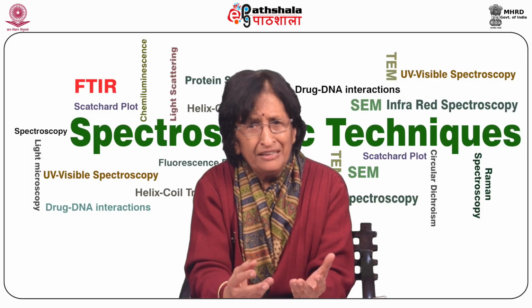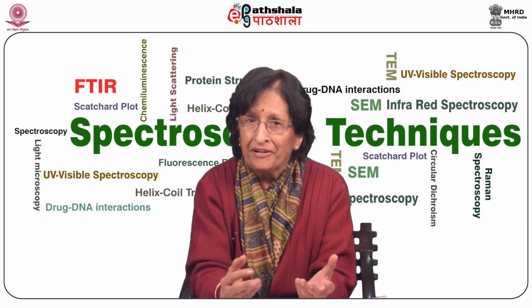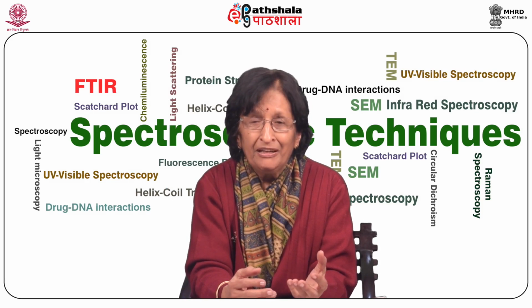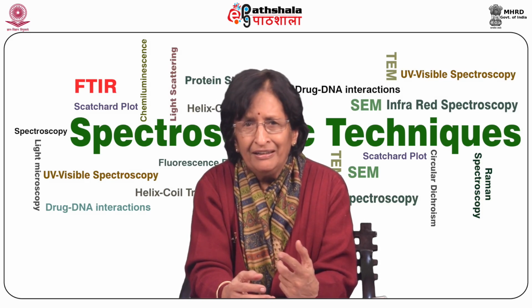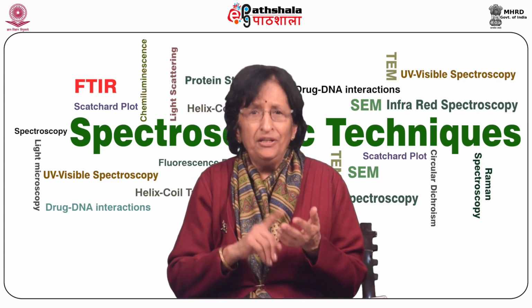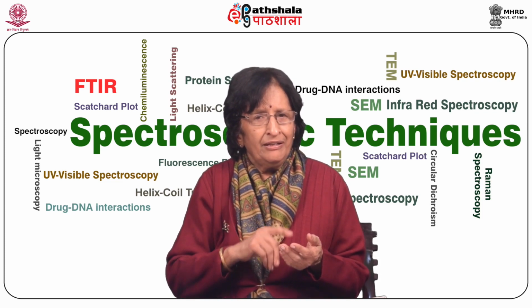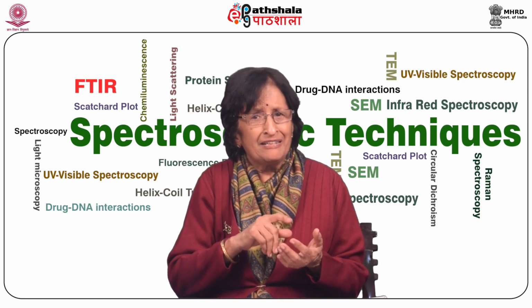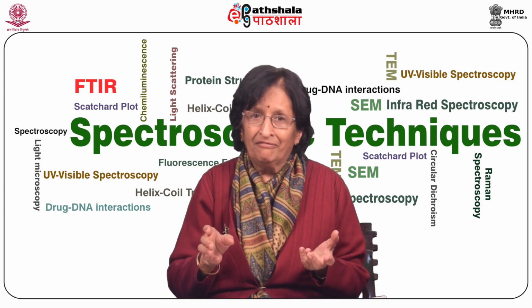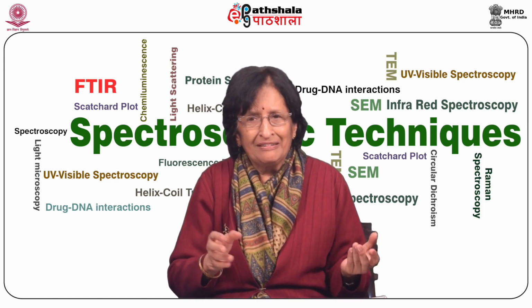Now, how does the local environment affect the spectrum? The wavelength of pi electron transition depends on the size and delocalization of the electron. The peptide pi to pi star electron transition is at 190 nanometers, while in DNA it is around 260 nanometers.